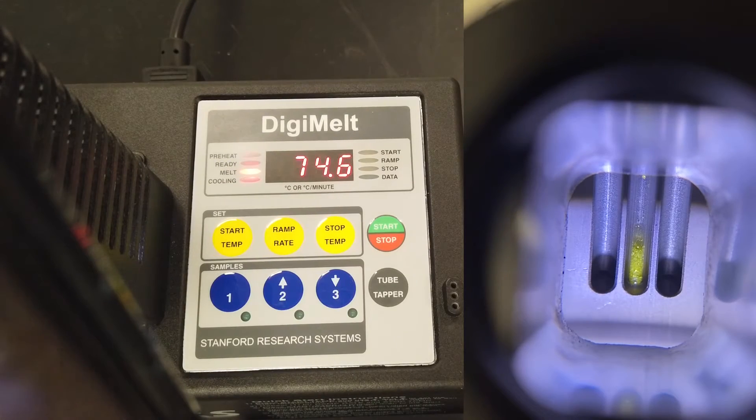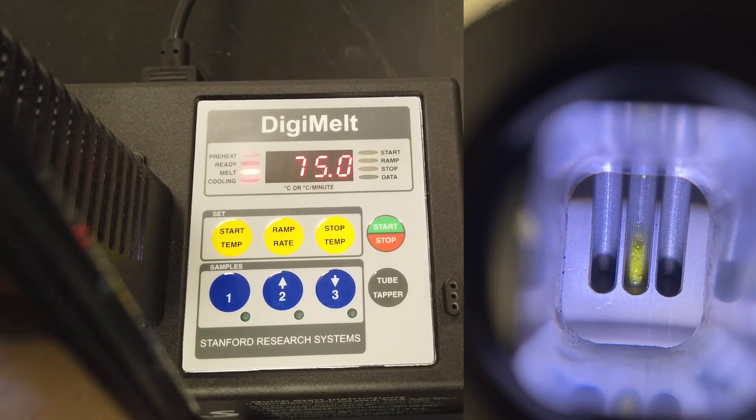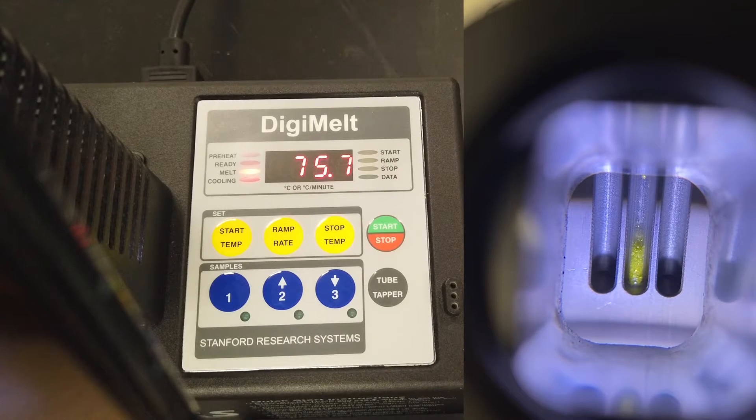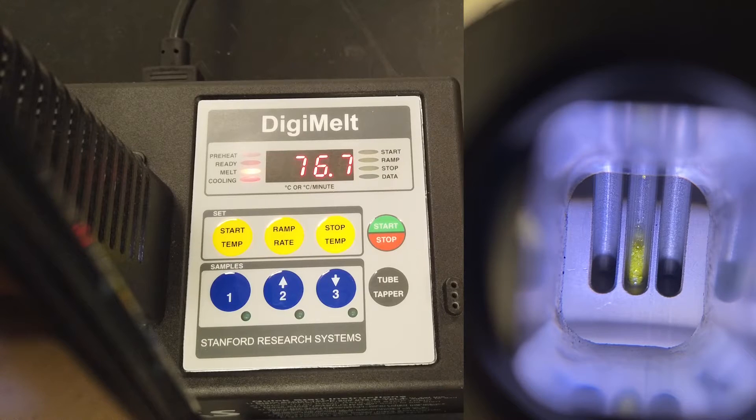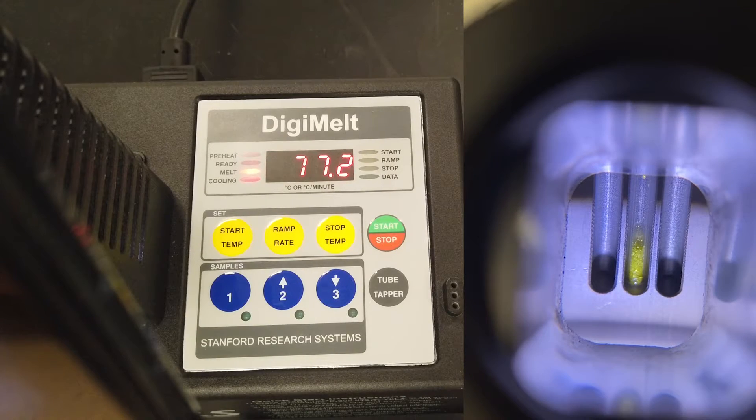Melting point range. The melting point is a physical property of a solid and can be used to help identify a substance. In practice, a solid usually melts over a range of temperatures rather than at one specific temperature. For this reason, it's more useful to speak of a melting point range.